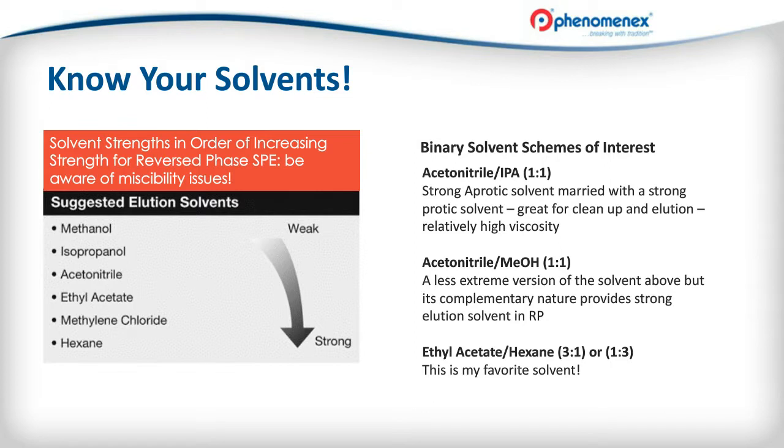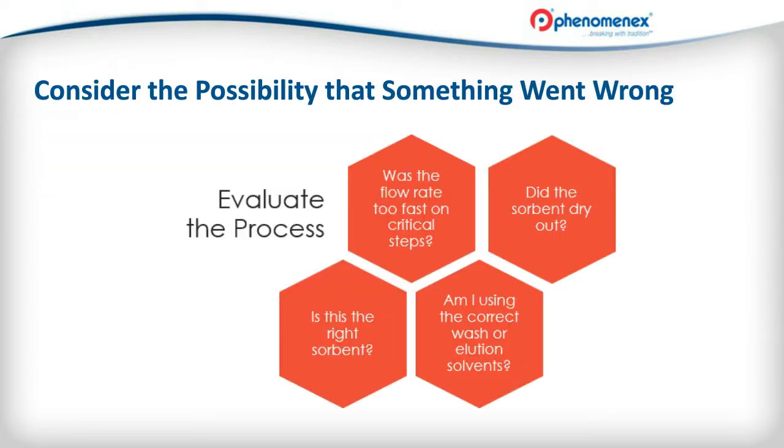So in any case, if something went wrong, please be critical of your general steps. It's a very hands-on technique, at least from a method development perspective. So please be very critical of yourself. Maybe accept the idea that you did something wrong. I know it's difficult to come to terms with. I try to tell myself not to second guess myself, so I'm kind of being a hypocrite. But anyways, you need to definitely evaluate each step of the process to make sure that you did everything correctly.